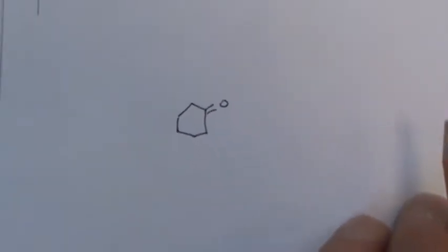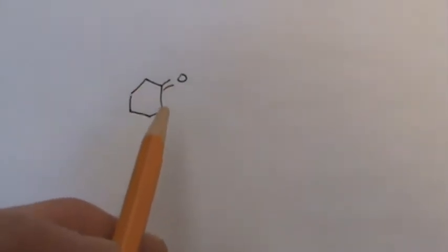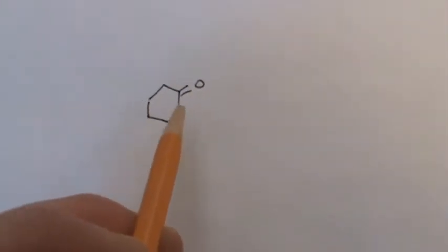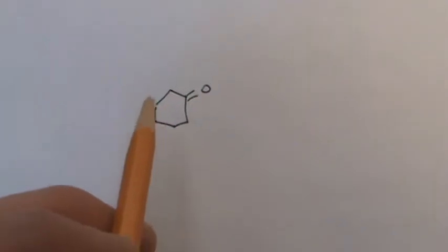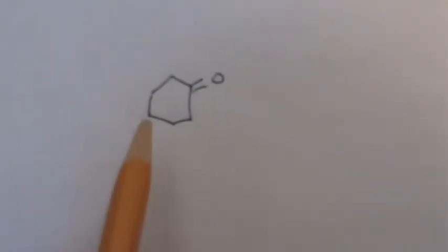These 2 carbons will be between 0 and 77, which is what we normally think of as the alkane or sp3 carbon region. Out of that region from 0 to 77, these carbons closest to the electronegative carbonyl should be further left. Then you should have these 2 and then that one. But the heights of them will tell us. So this carbon has to be the 2 carbons closest to that. Next in line, and tall, would arguably be that one, which it is. The shorter one belongs to that one.